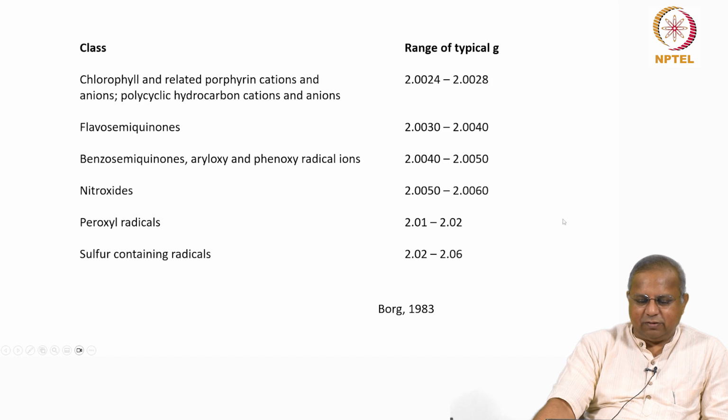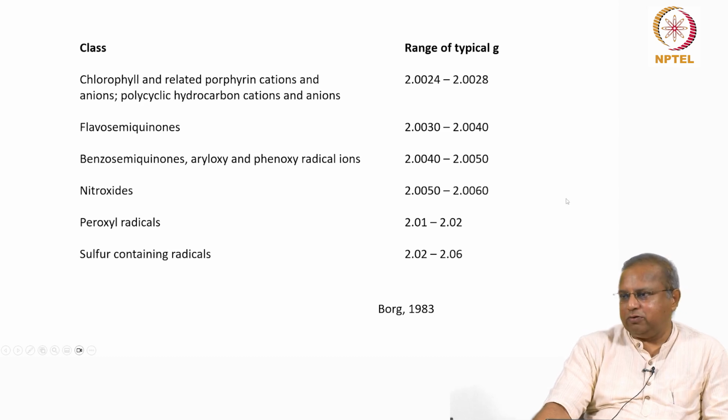So, it's all pretty much around that. But in those calculations, these numbers will make a difference. So, you'll have to use the appropriate G factor. Okay. This is also from Borg. If at all you're going to work with them, you need to go and figure that out.